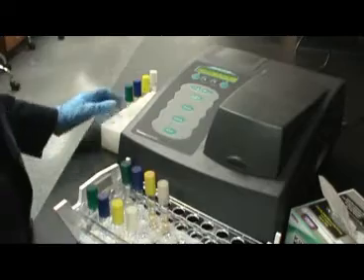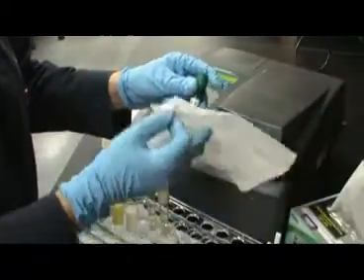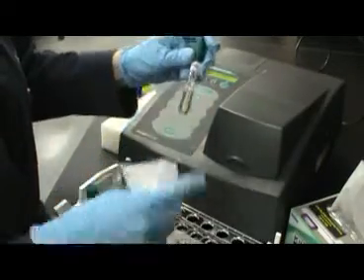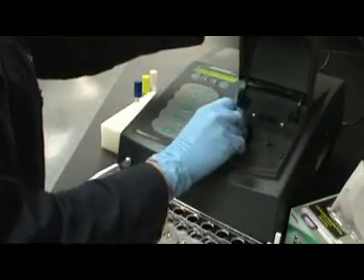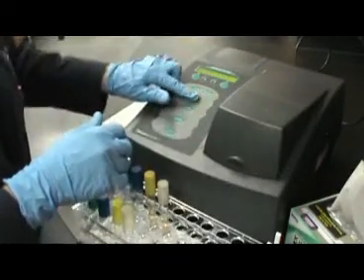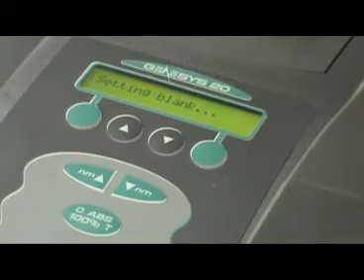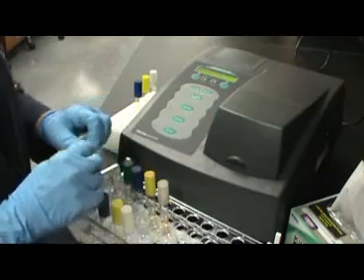To begin using the spectrophotometer, you must first set a blank for each of the media you will be testing. Here, the blank for GSB is being used. Be sure to wipe any fingerprints or dust off the tube using a chem wipe. Insert the tube or blank into the spectrophotometer and press the 0 ABS button. Wait until the spectrophotometer reads 0.0 A for absorbance.